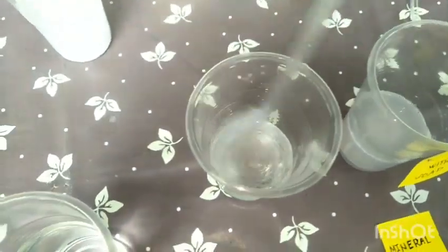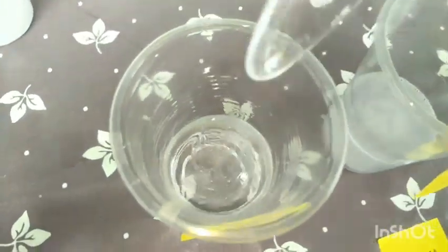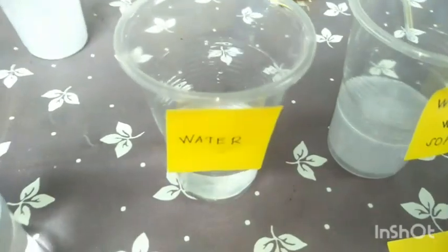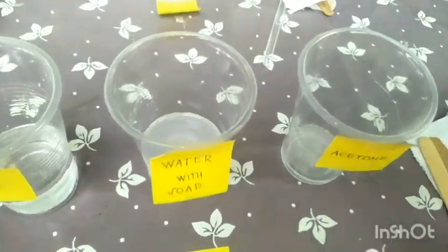Wow! The solubility of mineral oil is different. It is insoluble in water only, and it is soluble in water with soap and acetone.